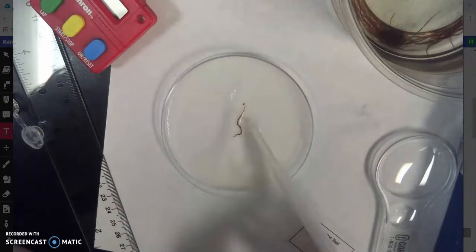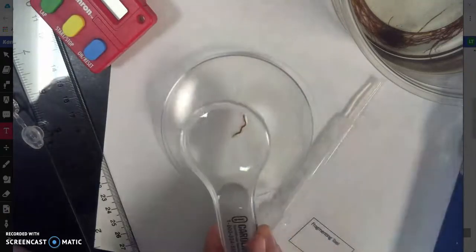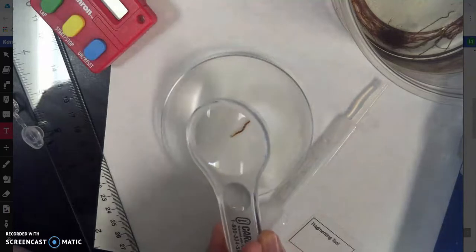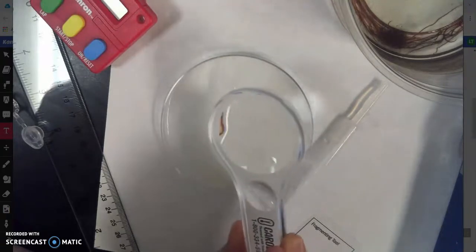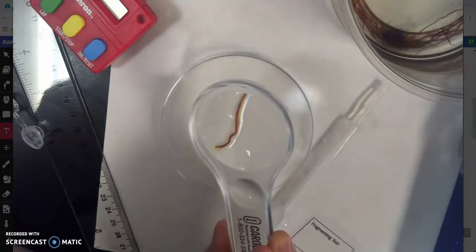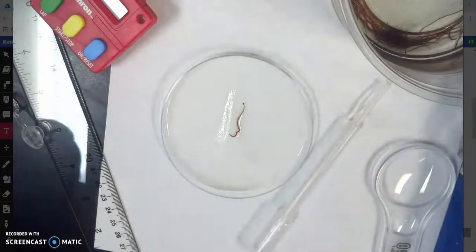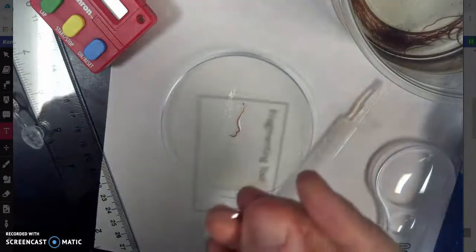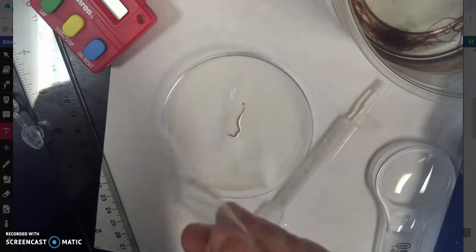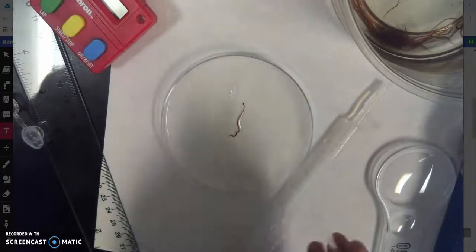There we go. We got a little air bubble right here. Okay. All right. Now, as you can see, I'm looking at it closer with my hand lens to magnify it. There we go. Okay, he's moving around a little bit, but he's staying pretty still. So I'm going to take this little piece of basically just really thin plastic film, and we're going to use this as our fragmenting tool.